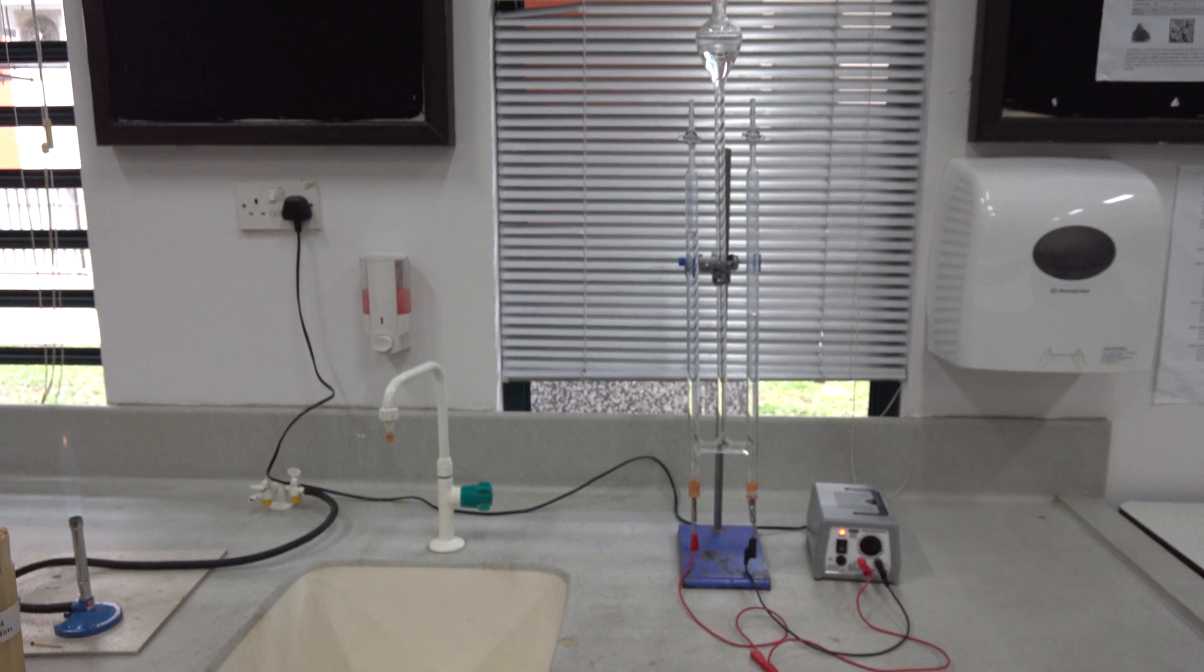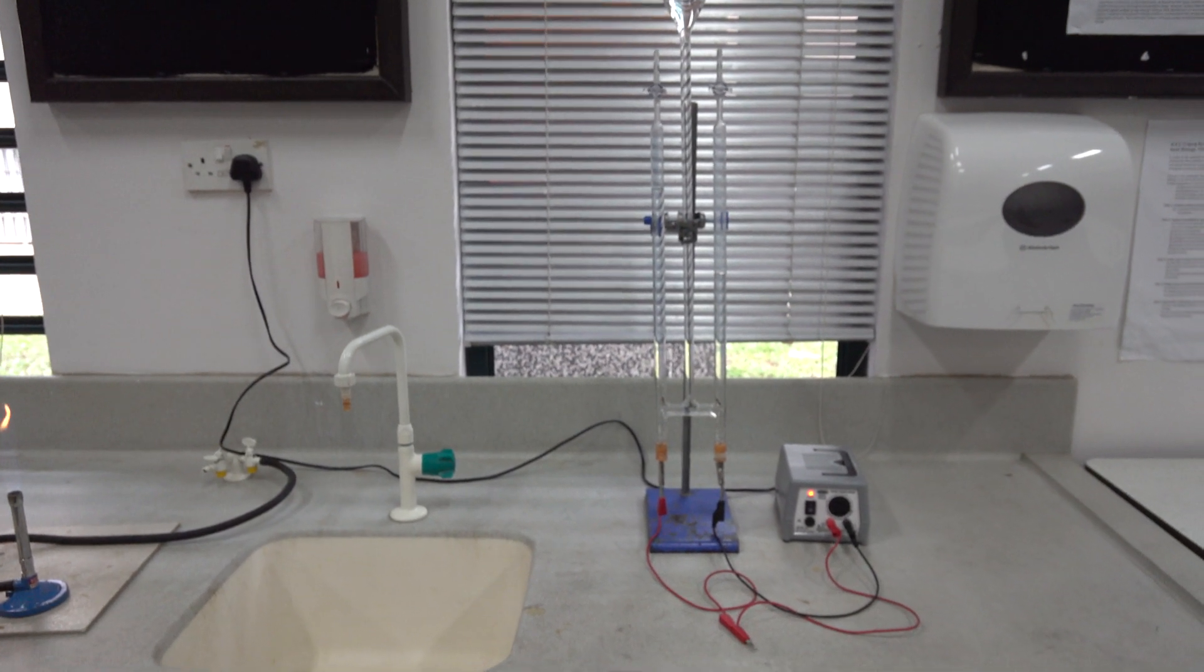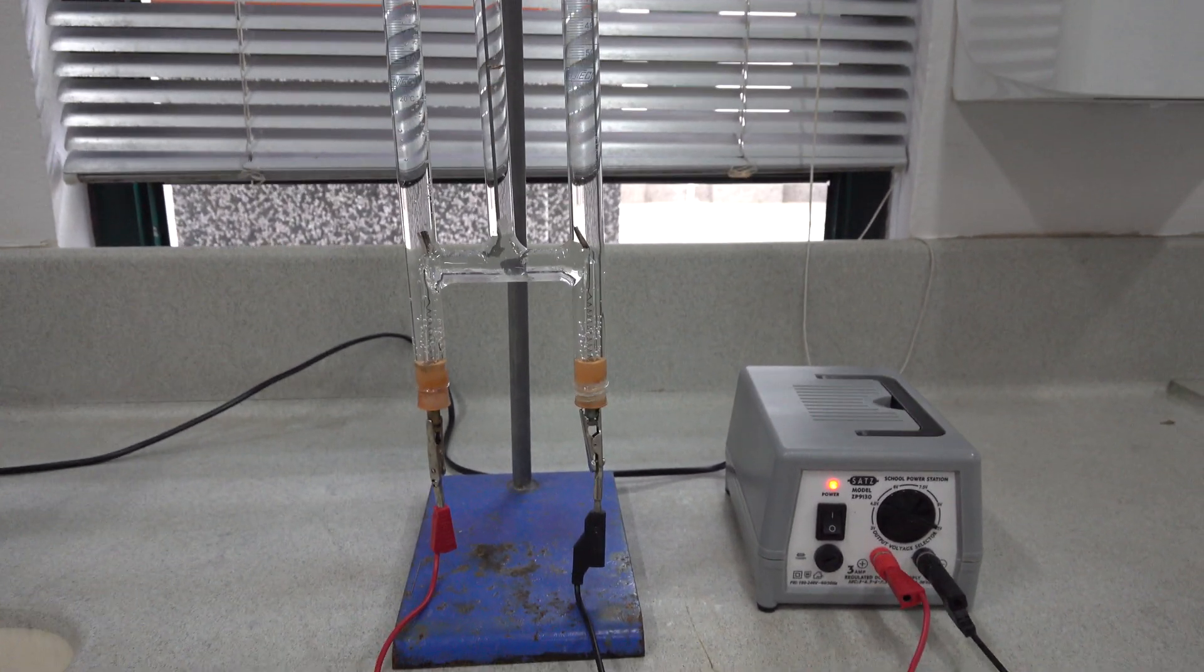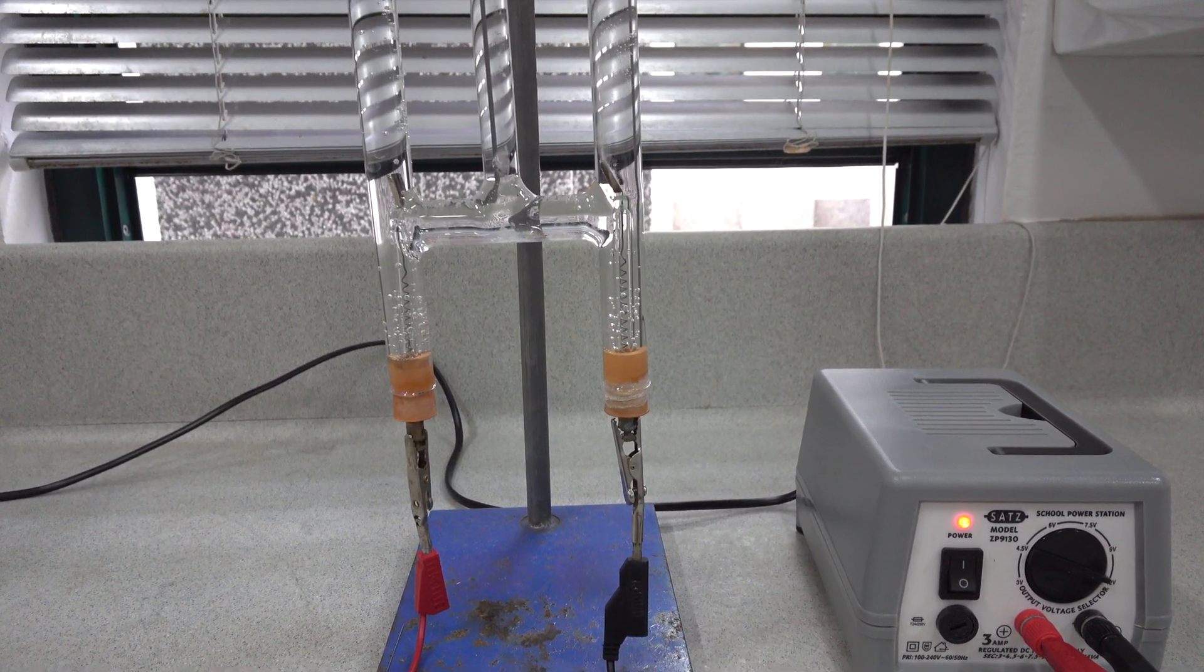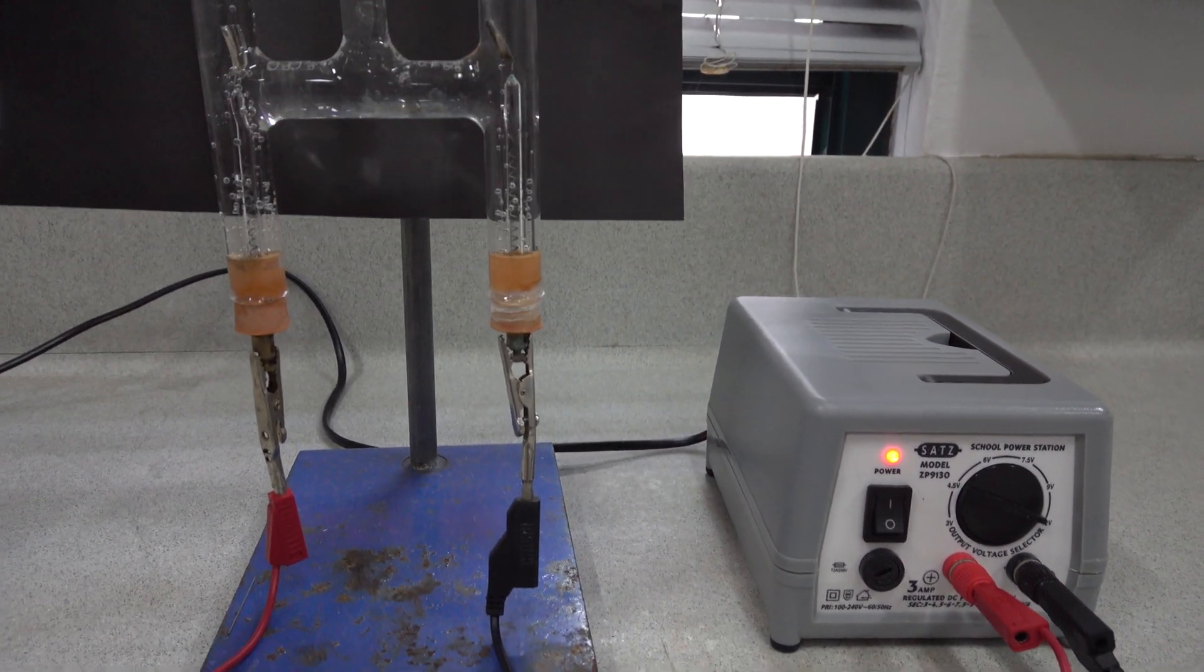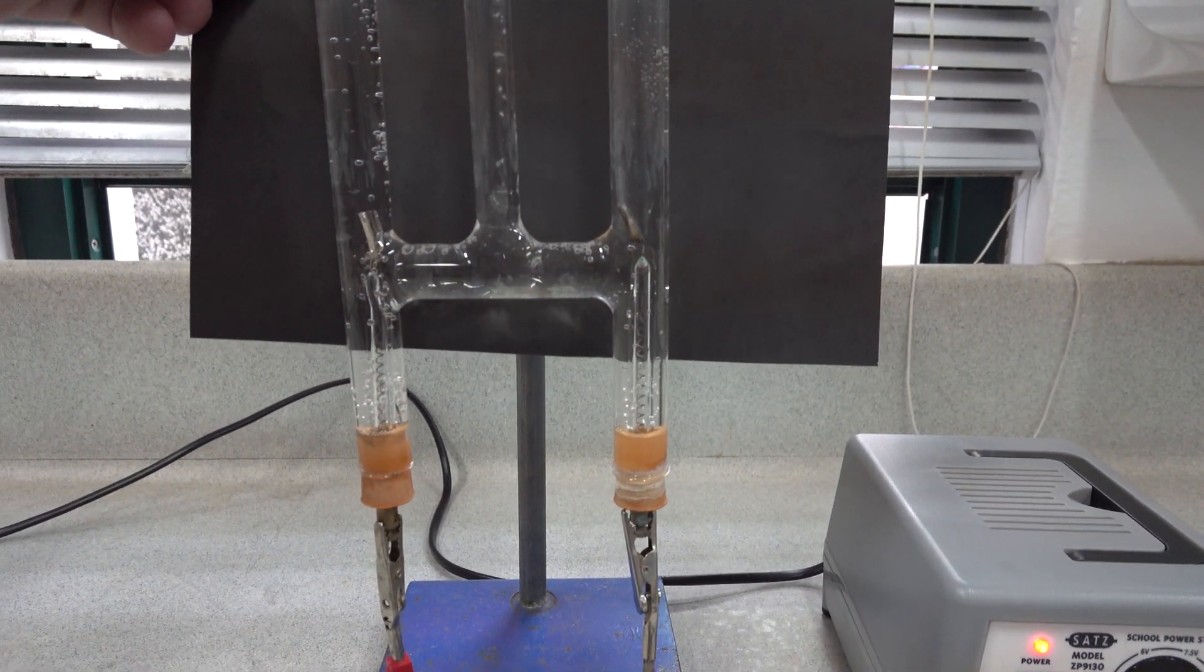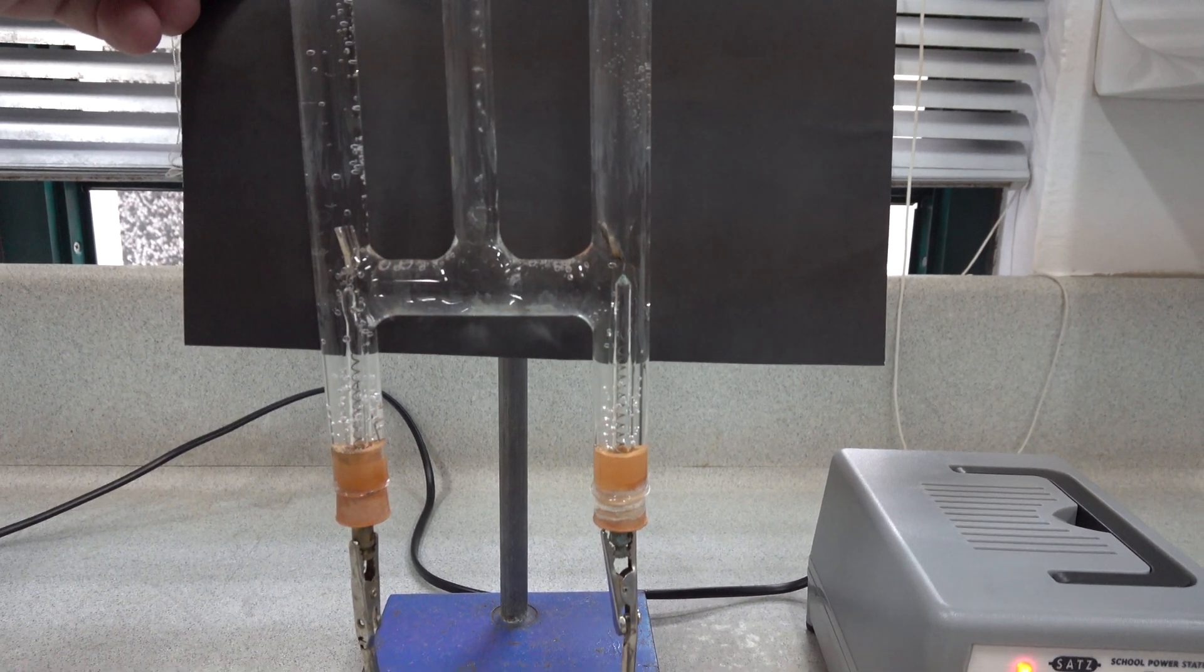The Hoffman voltometer for the electrolysis of dilute sulfuric acid. If we move in a little closer, you should be able to see two platinum electrodes. And if we use the black card, you may be able to detect the evolution of bubbles of colorless gas at the two electrodes.